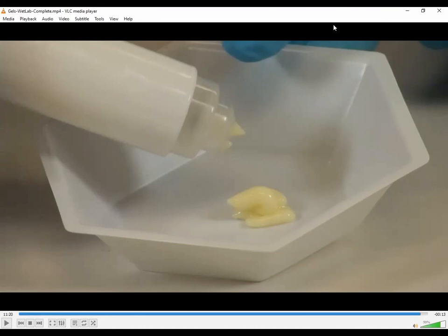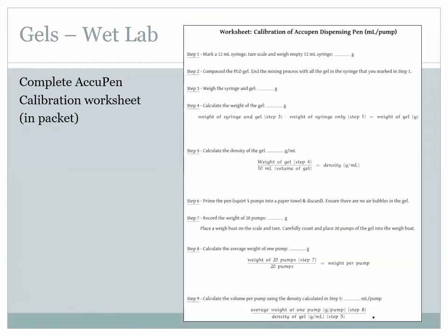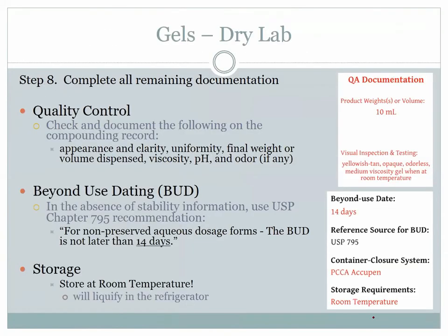So anyways, let me stop that. Sure, I think that's enough of the video. I'm not sure. Let me go back to here real quick, and let me go through a couple of things. All right, so that was the whole procedure and your worksheet there. Let's finish up real quick so we can be done with it, and you can just make it and then show us and then leave.